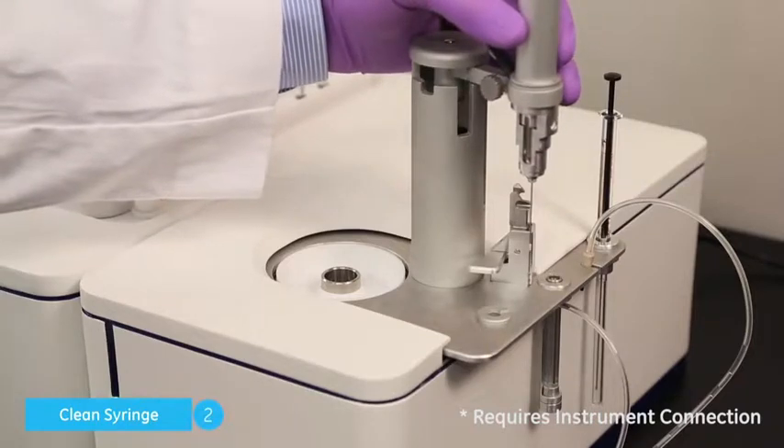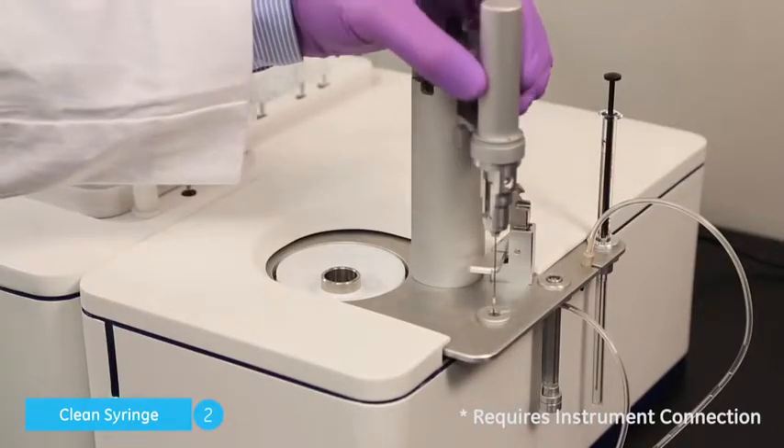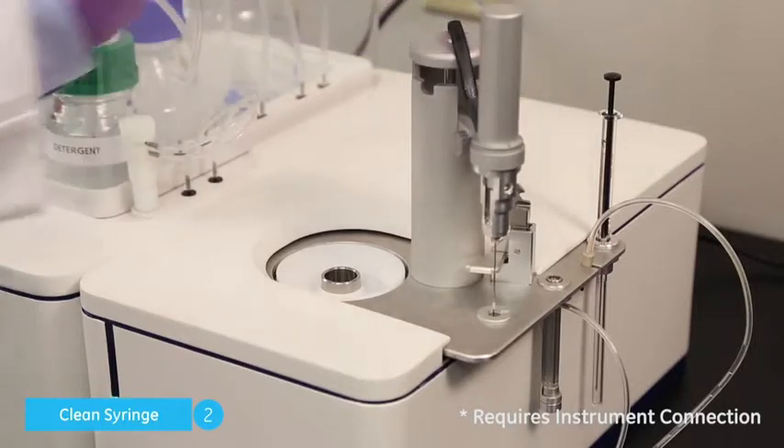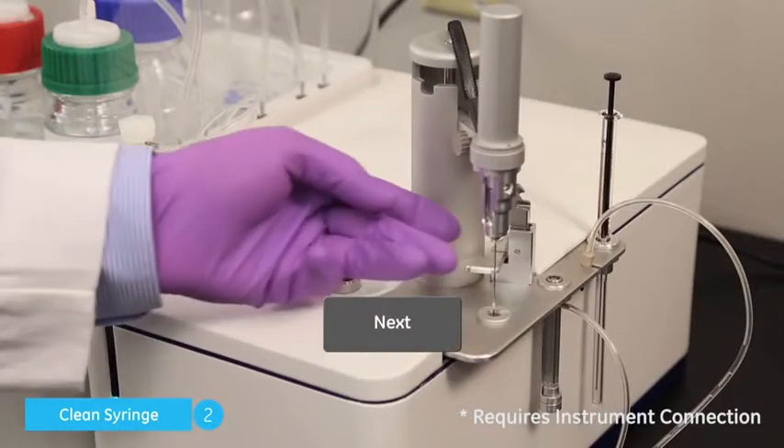Ensure the load location does not contain a PCR tube. Move the pipette to the load location. It should not be necessary, but have your hand ready to receive the syringe glass, and click Next.